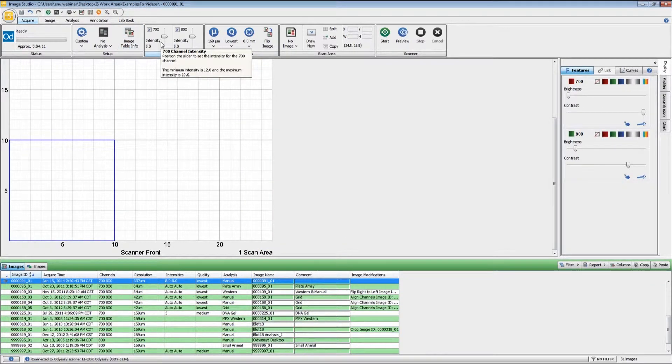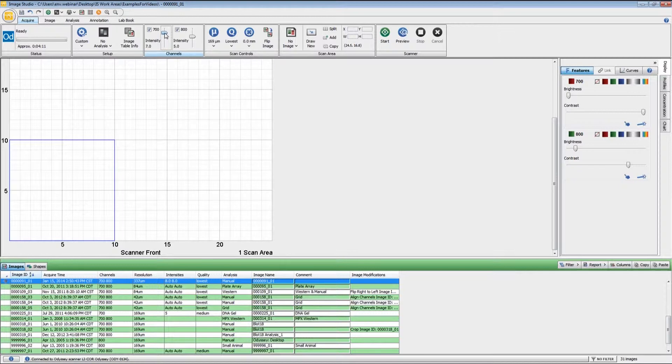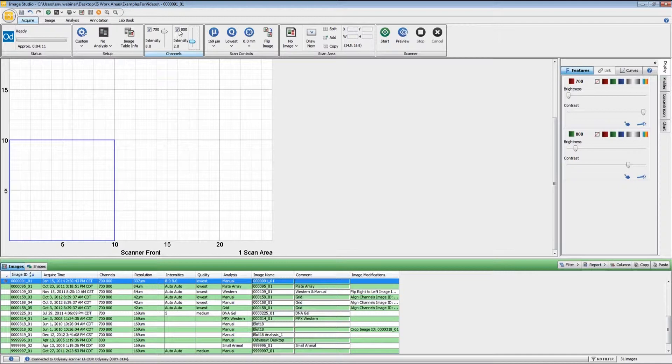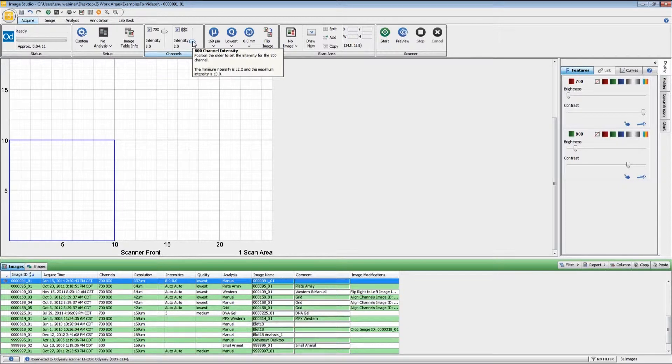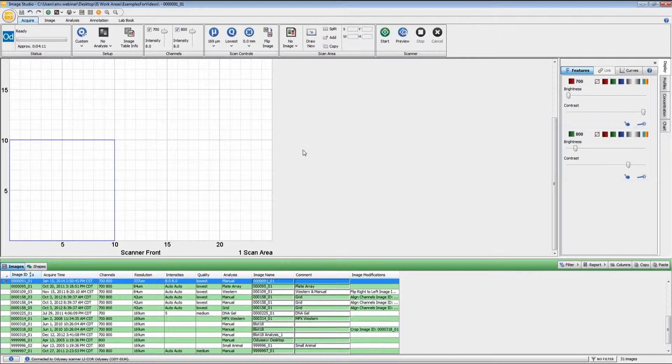The intensity settings will adjust the overall signal of the image. The default setting is five for most applications, and that's generally a good starting point. Each channel is independent of each other, so you can set those separately. You can turn off one of the wavelengths if you would like to as well, but it does not save any time during the scan; it will only generate one image file and save you a little bit of file space that way. For demonstration purposes, I'm going to set this to high just so you can see what having a too intense scan will give you.